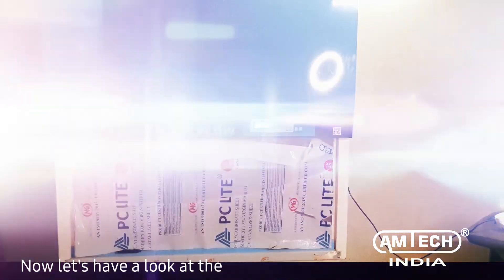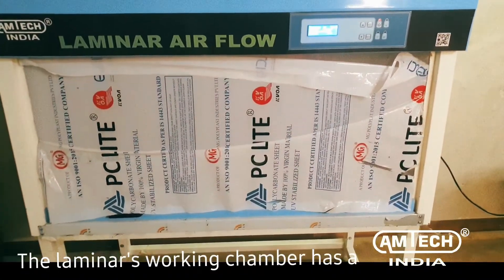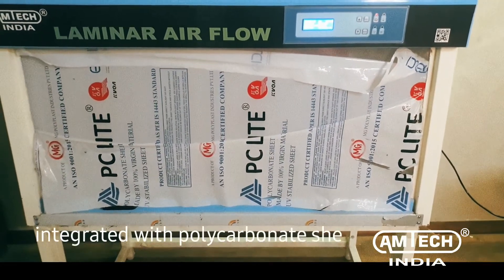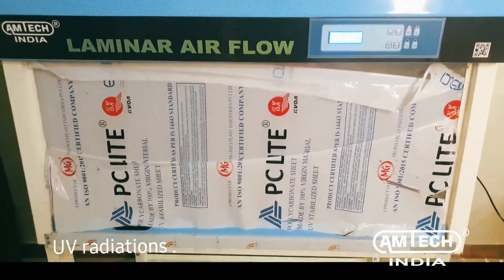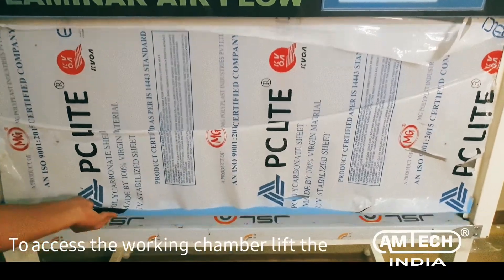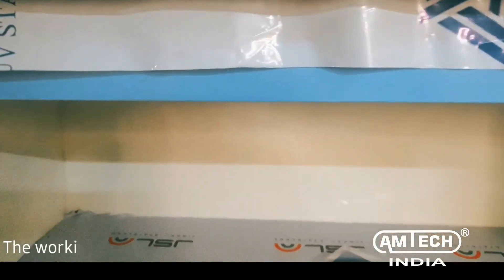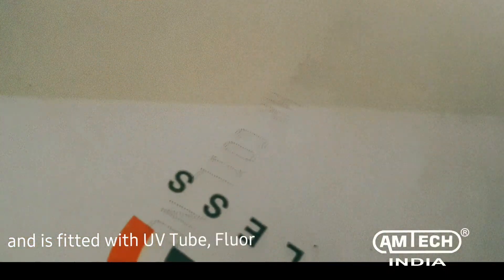Now let's have a look at the laminar parts. The laminar's working chamber has a front counterbalance sash door and is integrated with a polycarbonate sheet, which acts as a shield to harmful UV radiations. To access the working chamber, lift the front door up. The working chamber has a 300 grade SS platform and is fitted with a UV tube, fluorescent light, and blower as shown.